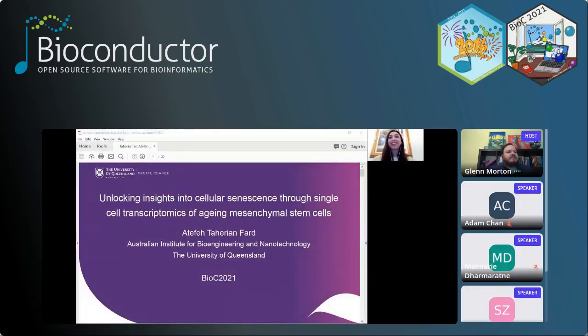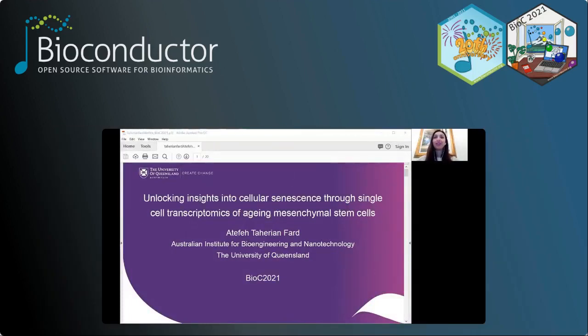My name is Atefeh, and I'm a postdoc at the Australian Institute for Bioengineering and Nanotechnology at the University of Queensland. I'd like to thank the team for giving me the opportunity to present my work today. I'll be talking about unlocking insight into cellular senescence through single-cell transcriptomics of aging mesenchymal stem cells. This project has different exciting avenues, but I'll be presenting only the data analysis or bioinformatics part of the project. Also, this talk isn't really about a specific R package, but rather the utility of different R packages to analyze high-throughput single-cell RNA sequencing data.